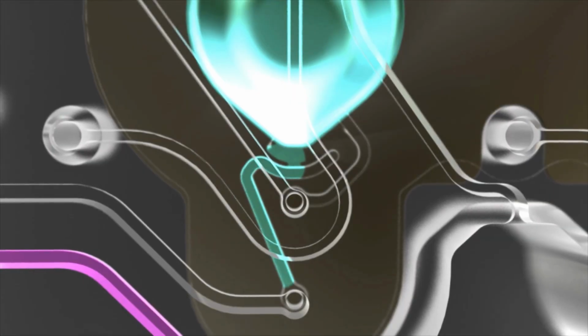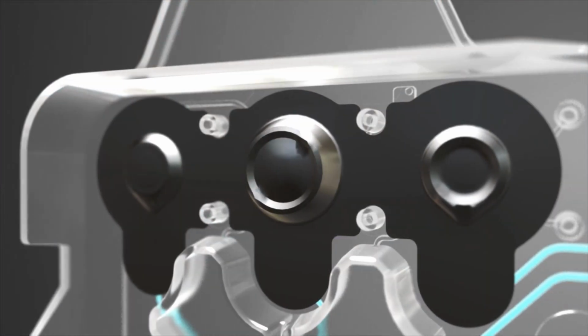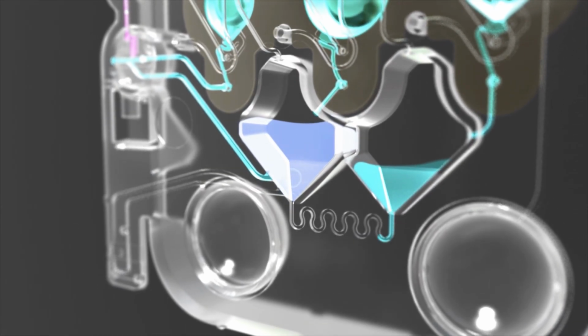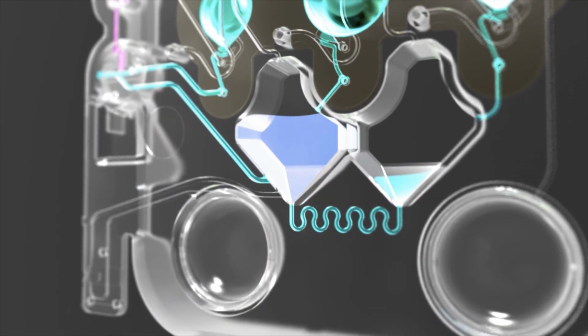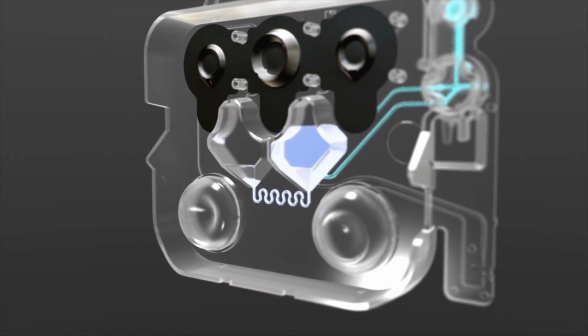From there, the ACCELLIX system takes over. First, blister A is broken, flushing the sample into the front mixing chamber, along with the diluent. The remaining 2 blisters can also be used, depending on the assay being performed, and their diluents can offer up to 4 possible dilution ratios, to account for cell concentrations from 10 to 10,000 per microliter. The sample is pushed and pulled between the mixing chambers until homogeneous.